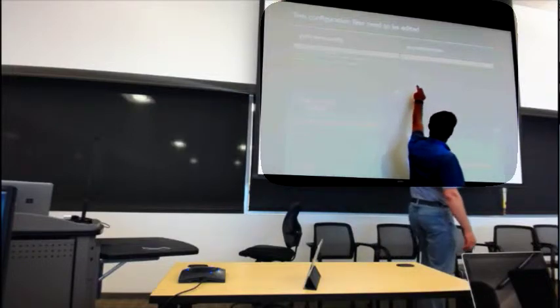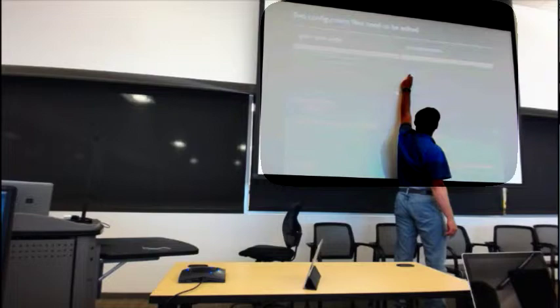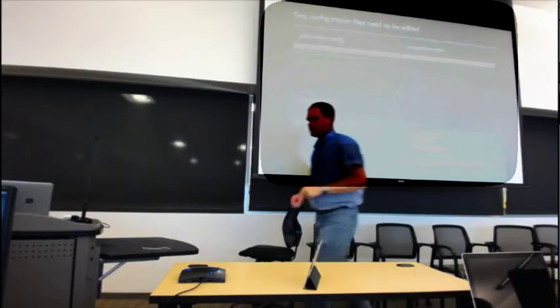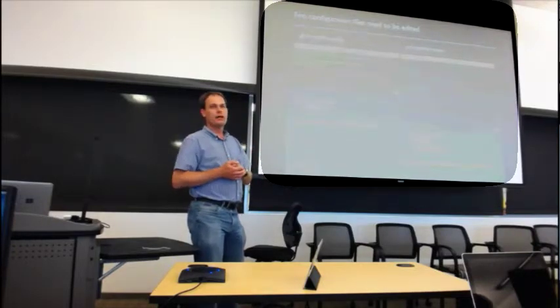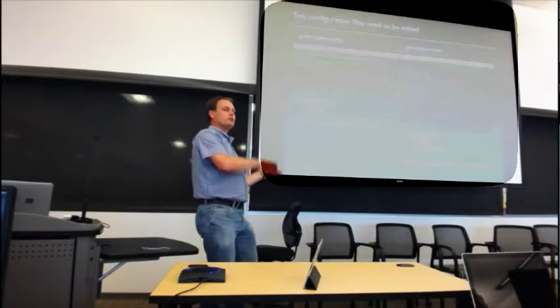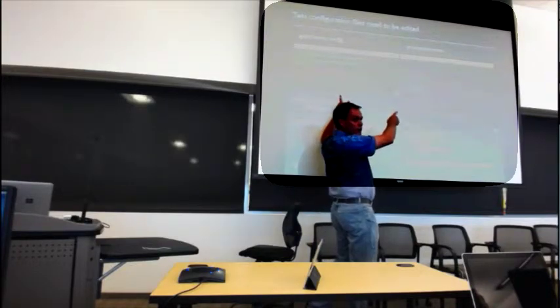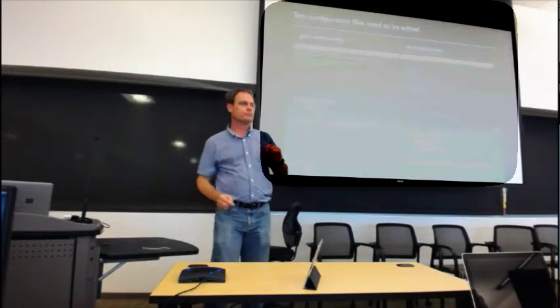Once again, I should have set up already where the XTC is, but you'll have to change these two things, the H5 dir and the config dir, to add your private little directory in there. I couldn't do that for everyone because it's all different. But think of it this way: if you're coming in and you're trying to start a new experiment, you just copy this template over. You have to modify these two files, which are hopefully moderately self-explanatory, and then you're ready and up and running.